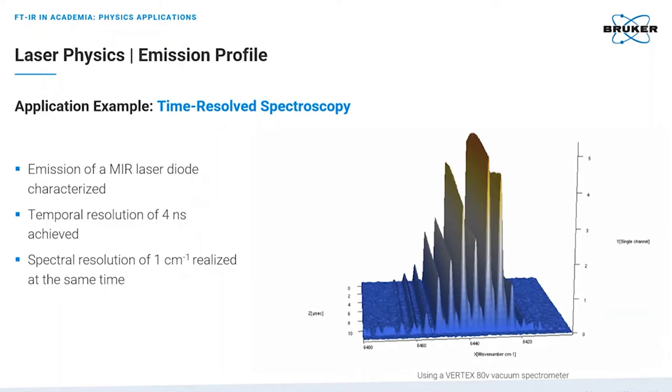Here you see we are able to achieve high temporal and high spectral resolution at the same time using the step scan technique. Indeed, similar or even identical setups are used in research labs to record the emission profile of a pulsed laser over time, or to characterize newly developed emitting devices with temporal behavior.